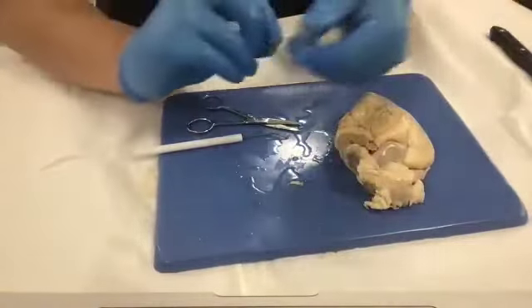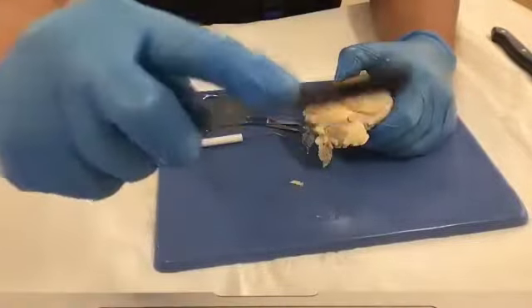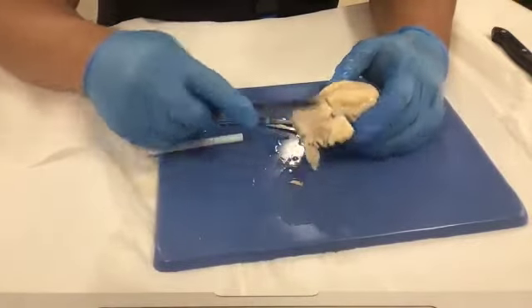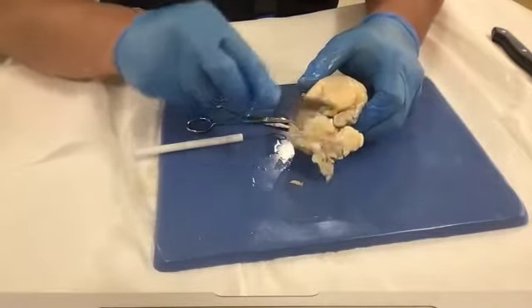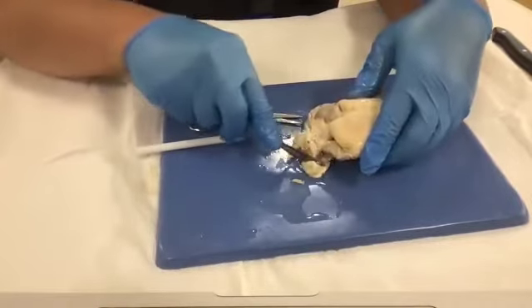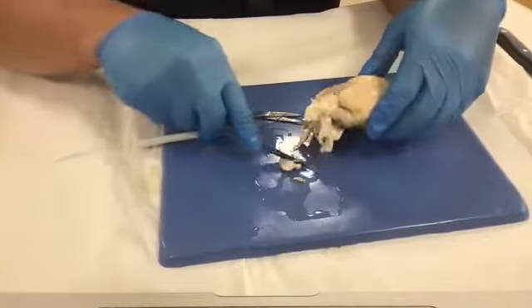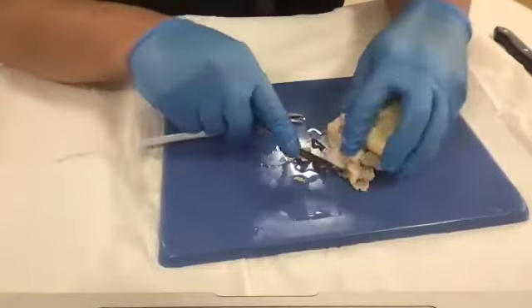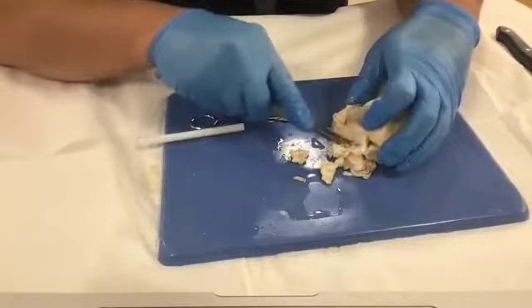Another thing that I could use is a scalpel. I could either hold it like this, like a pen, or I could hold it like this, okay? Now, notice I'm cutting away from myself and I'm cutting in small sections, because if you cut in exaggerated sections, it could be too forceful, you could cut yourself. So as I'm cutting away some of this stuff, okay.